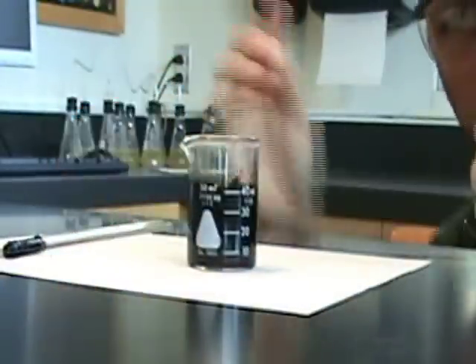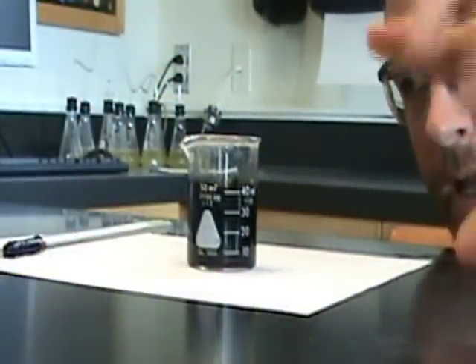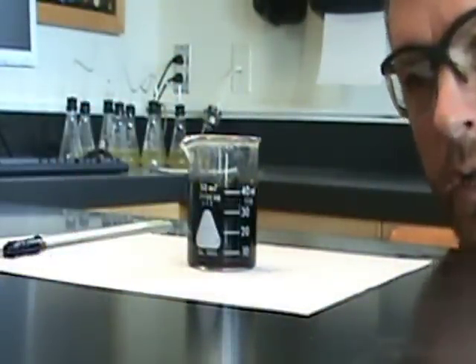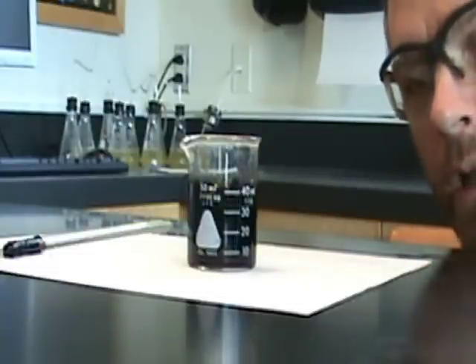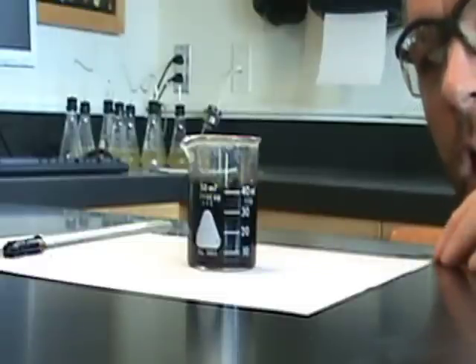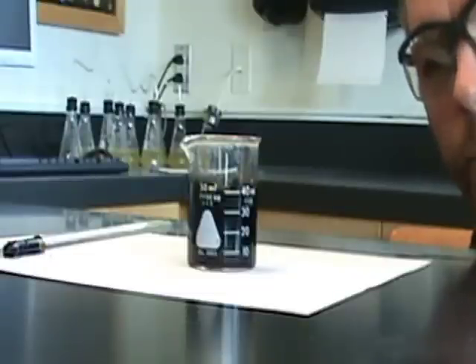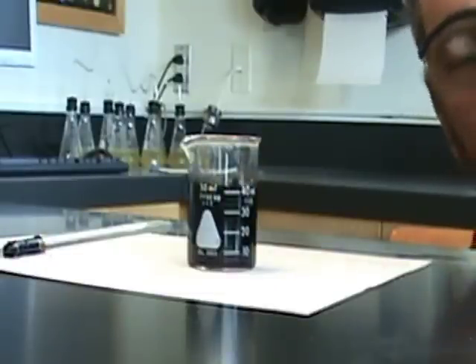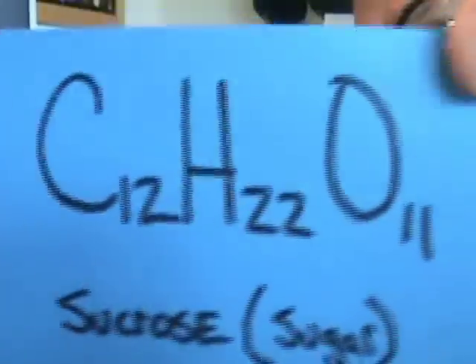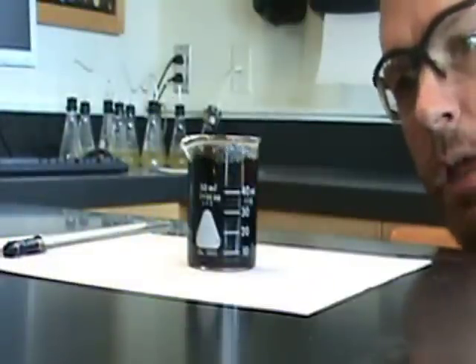Just keep watching. You can see an immediate change already — we had white crystals and a clear liquid, and now we have kind of a black, goopy liquid. What's going to happen is as this reaction gets going more and more, water is actually being removed from the sugar. Remember, you had C12H22O11.